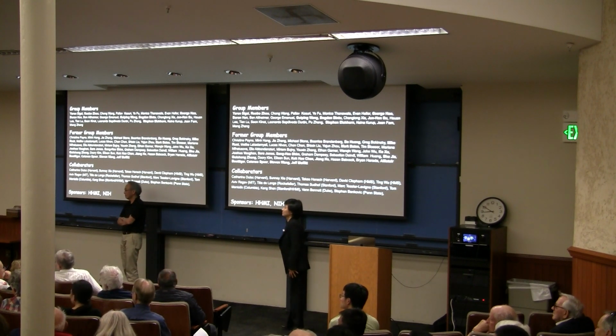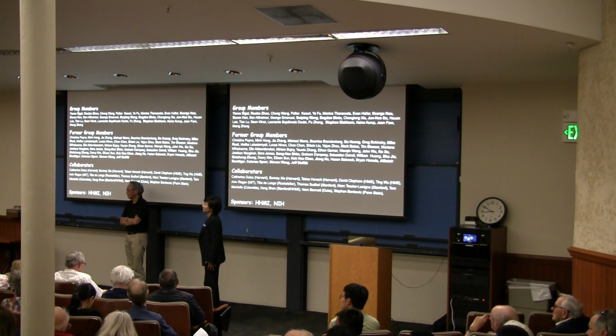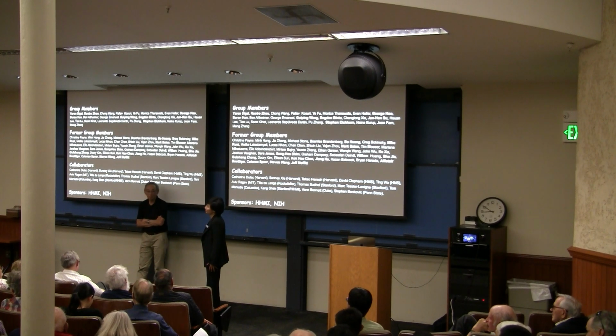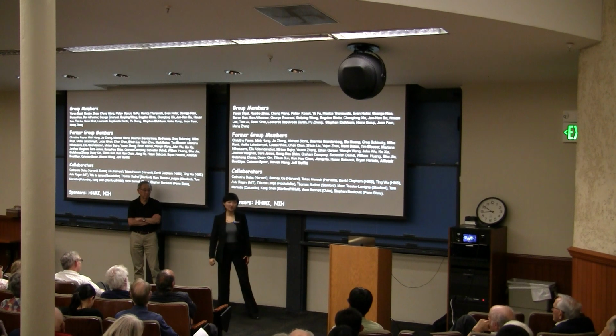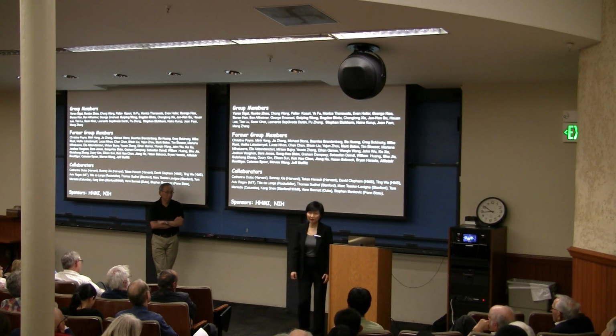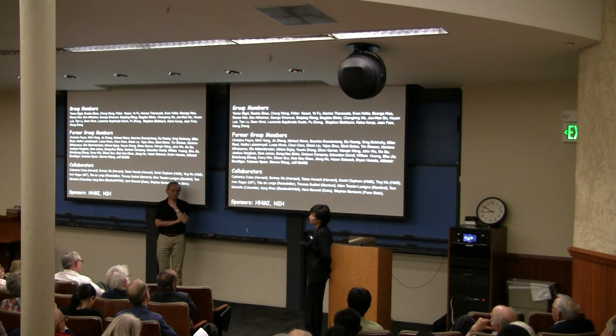You label these molecules with very large fluorescent dye molecules. And I was wondering, are you worried about this influencing the structure of the molecules and the interaction of the molecules? Is that an issue at all, or is it not an issue? It is something that one needs to be careful about. So there are different kinds of labeling approaches. And for some of the labeling approaches I talked about today, it's less of an issue.